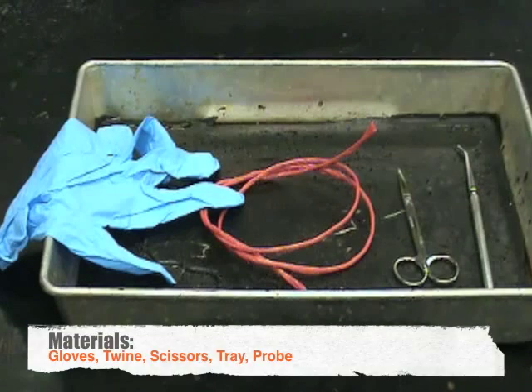The materials that you will need are gloves, twine, scissors, a tray, and a probe.